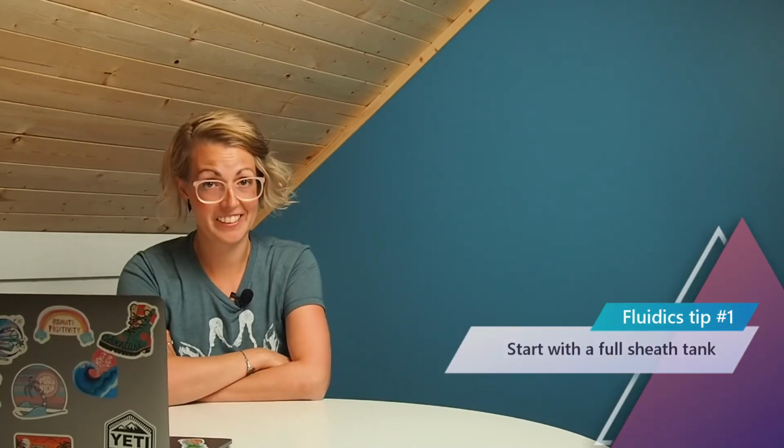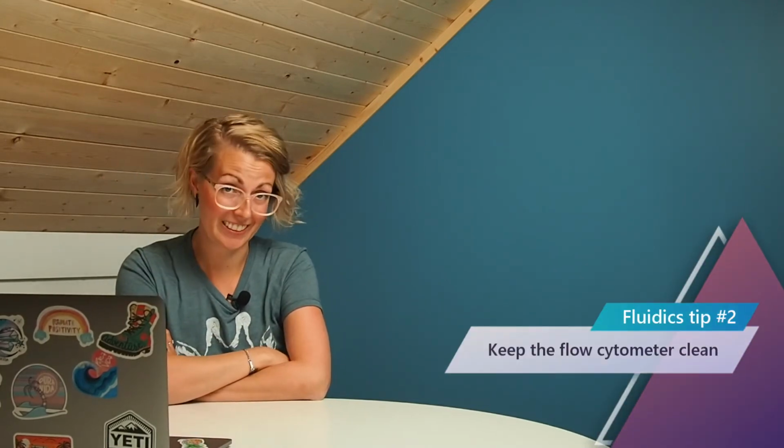Tip number 1, start with a full sheath tank. Fluidics require consistent pressure. Starting with a full sheath tank will help you achieve this inside the machine. Tip number 2, keep your machine clean. Debris, dirt, cells build up inside the fluidics lines are fluidics' worst enemy. Meticulously clean your machine to remove these between each run.